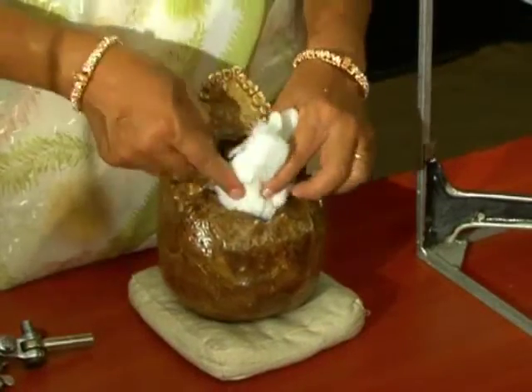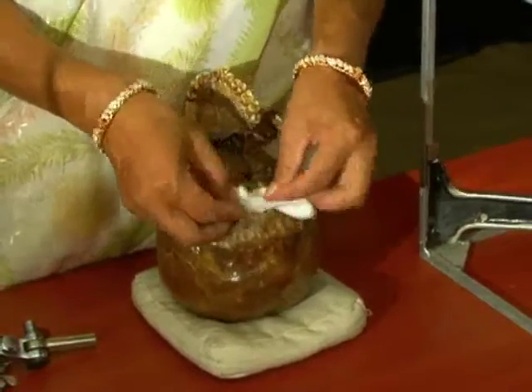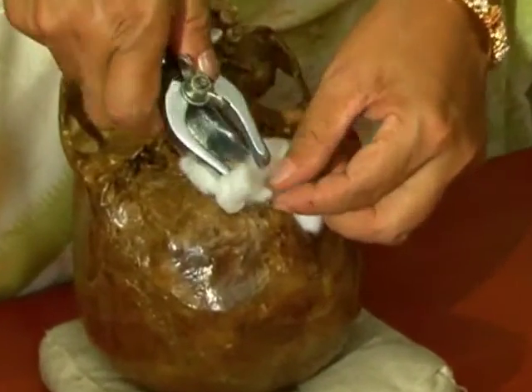Precaution. The skull has to be mounted on the FH plane, without which the craniographic drawings, including the angle readings, will not be accurate. Cotton pads have to be adequately used to avoid any damage to the skull while orienting it to the skull holder.